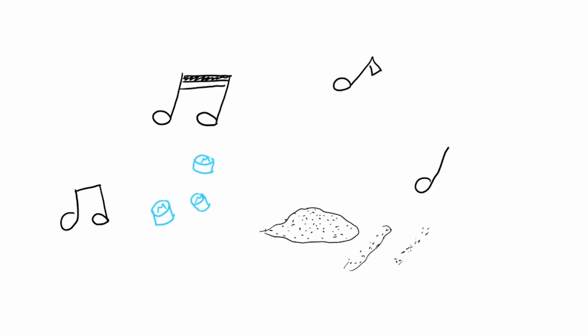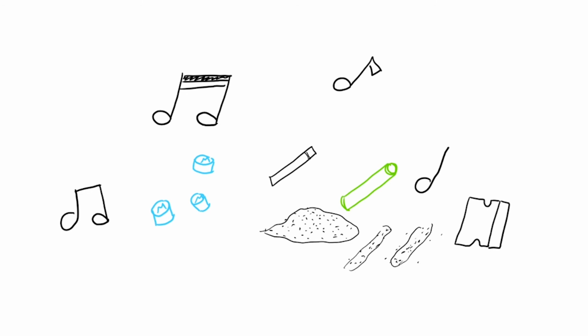IR also has the benefit of being able to differentiate diastereomers and free-base acid and salt forms. Free-base or acid forms often have a lower boiling point, allowing them to be smoked, whereas the salt form is more stable, usually soluble in water, and allows for injection. An example of this is crack cocaine, which is the free-base form, and cocaine, salt, even though they are both the same drug.